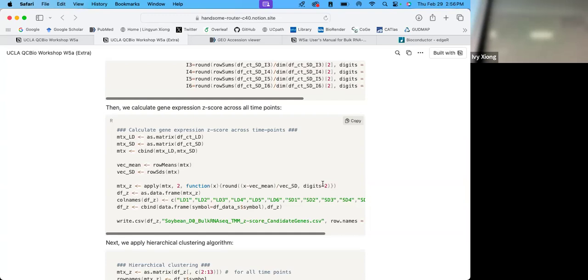Yeah, so now it's very, we have changed. Yeah, for both of them. So.